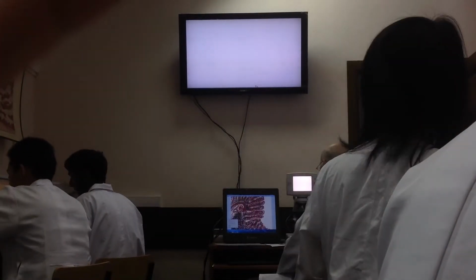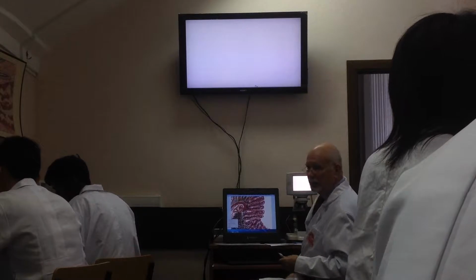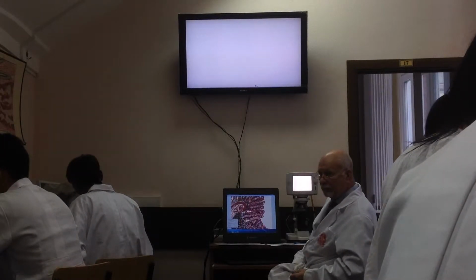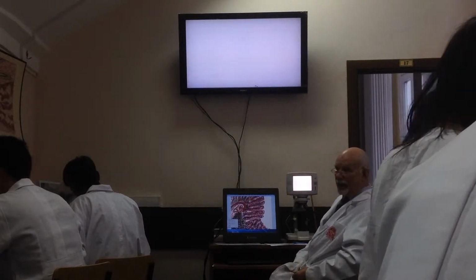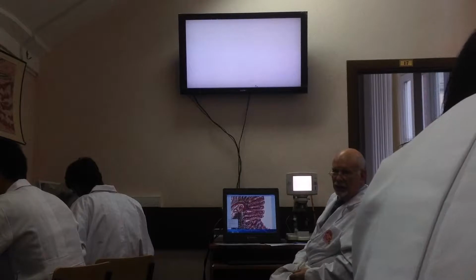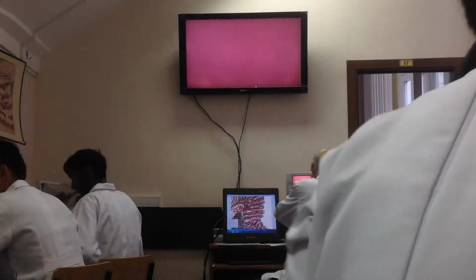Who can remind me the type of this gland? Usually we classify the glands into two main groups. Endocrine, exocrine. Pancreas. Yes. There are structures that participate in pancreatic juice production, so exocrine, and there are the structures producing hormones, endocrine structures. So we have to find both.